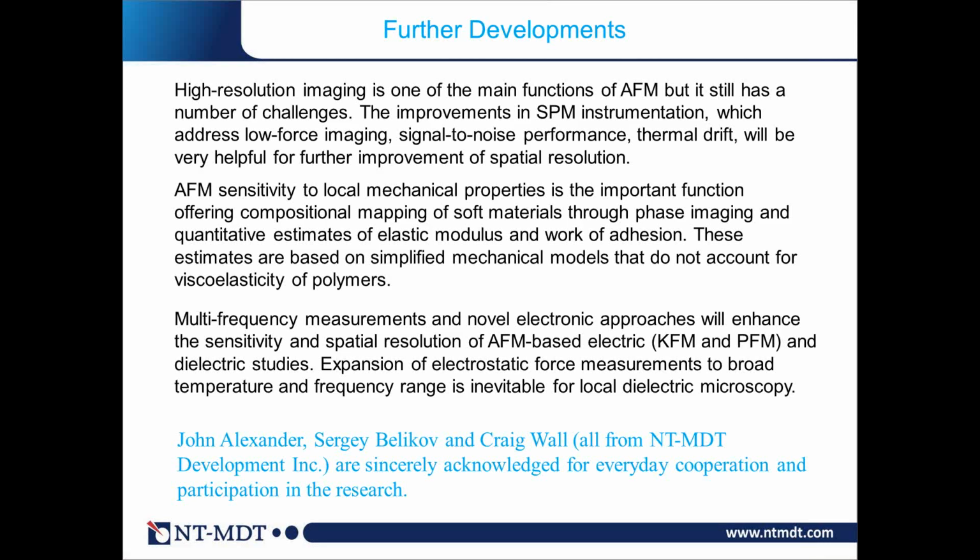People try also to bring the electric measurements down to the liquids, and there are a couple of papers I'm aware of, but again, it's just at the beginning. It's tricky because again, if we apply the multi-frequency measurement, we need to have a very well-defined vibrational spectrum of the cantilever in liquid. Then we can separate mechanical and electrostatic interaction, one for the purpose of imaging, another for detecting the electric response.